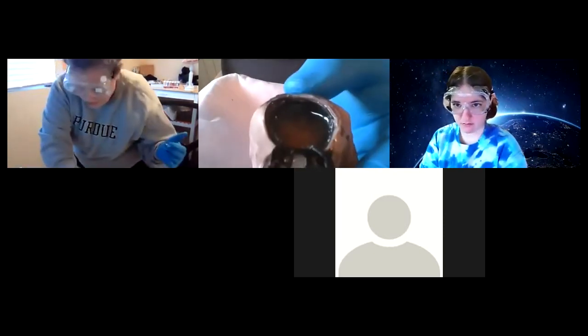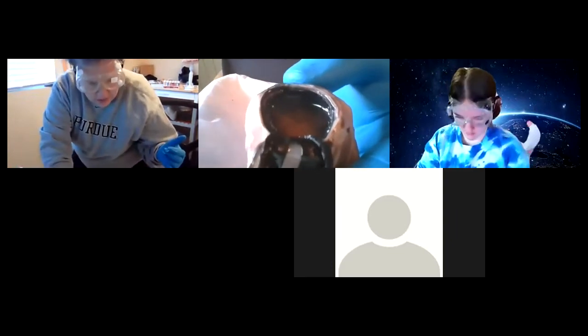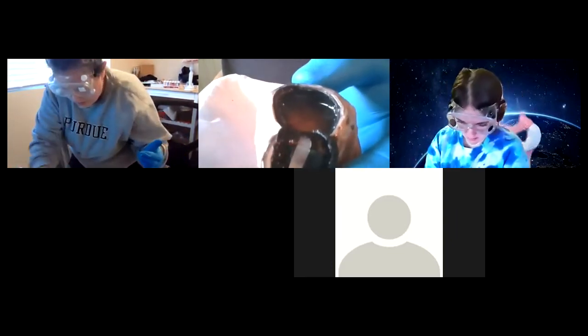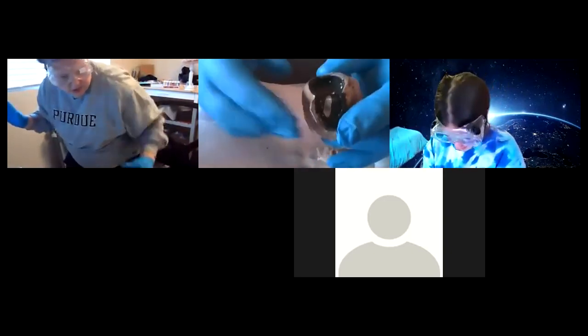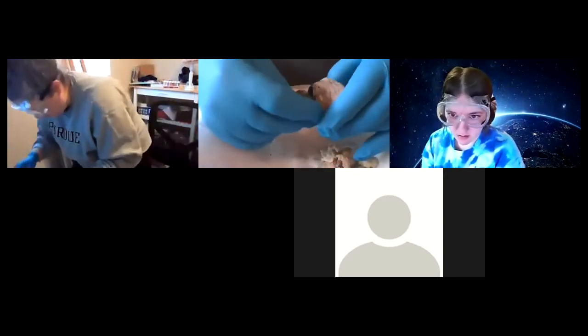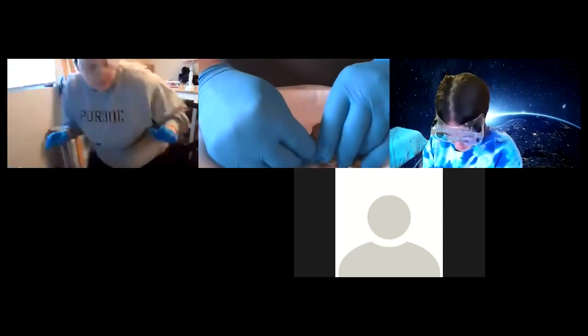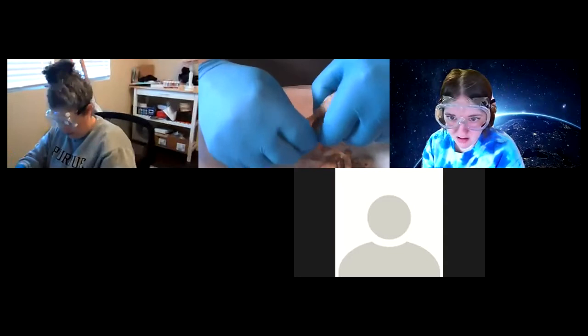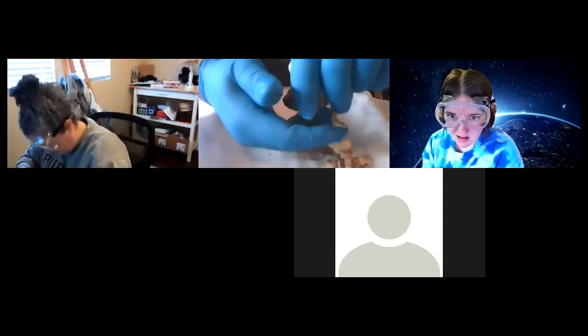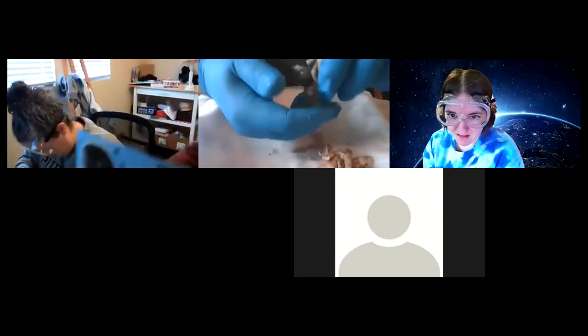Look at the fluid here — be careful, you don't want to spill this all over your clothes. This is why I'm wearing goggles too, just in case. You should be able to get the vitreous humor here. If you squeeze this a little bit, it's a really blobby-looking material — it even makes a nice sound.